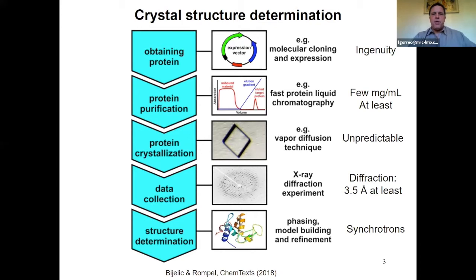For structure determination now, most people will ship their crystal to the synchrotron, which is lots more powerful and has a tunable X-ray beam. And in the background, the IT system now means that you can solve a structure, if you have the right data, of course, in a very fast way. You can screen the crystal faster and you can solve the structure lots faster now.